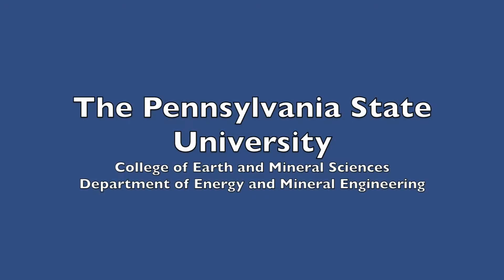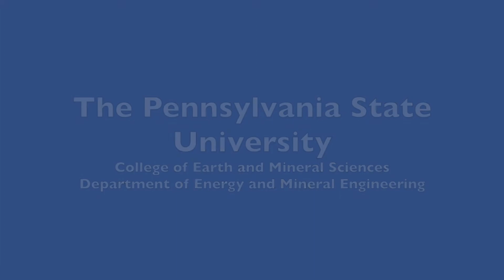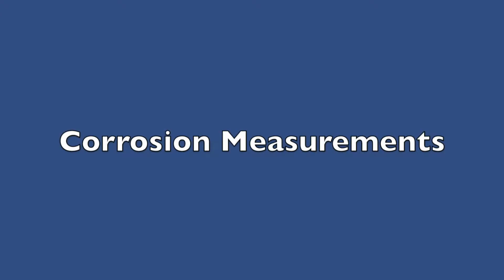The Pennsylvania State University, College of Earth and Mineral Sciences, Department of Energy and Mineral Engineering presents the Electrochemical Laboratory instructional video, Corrosion Measurements.